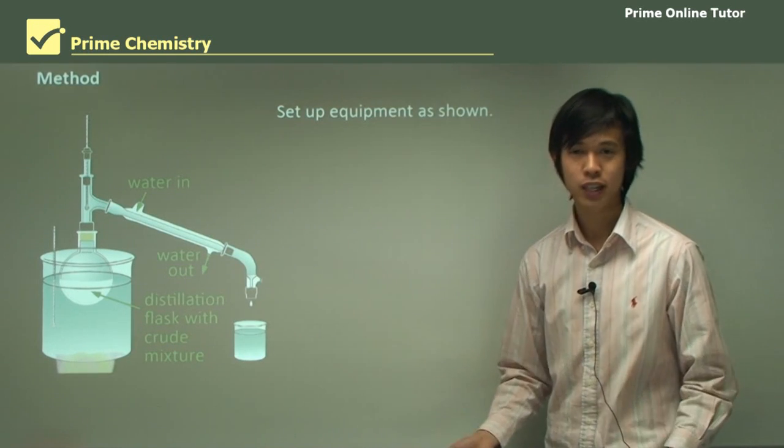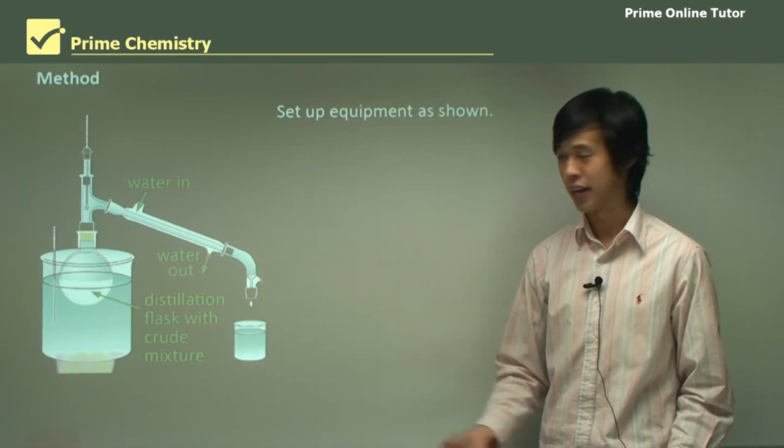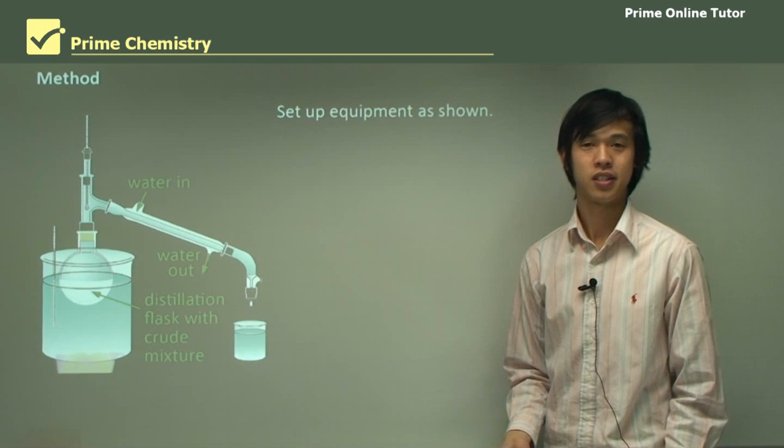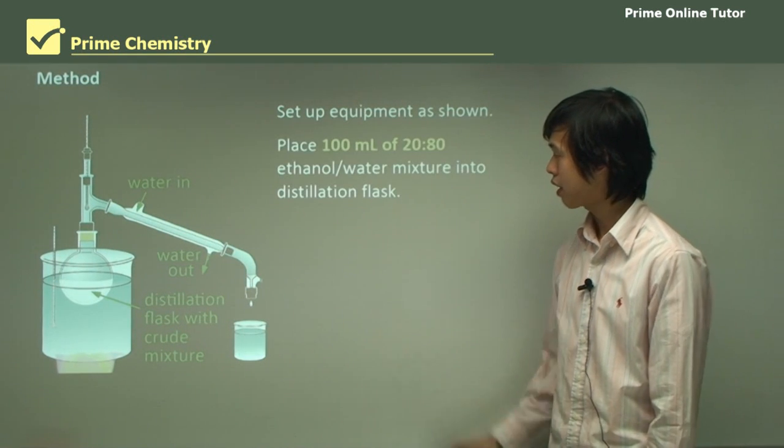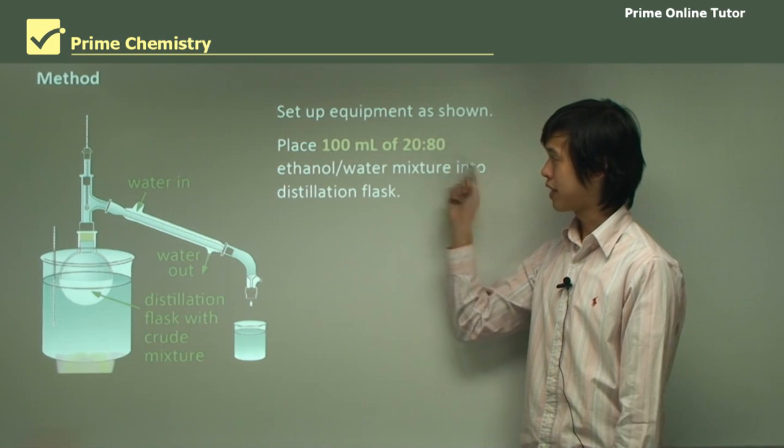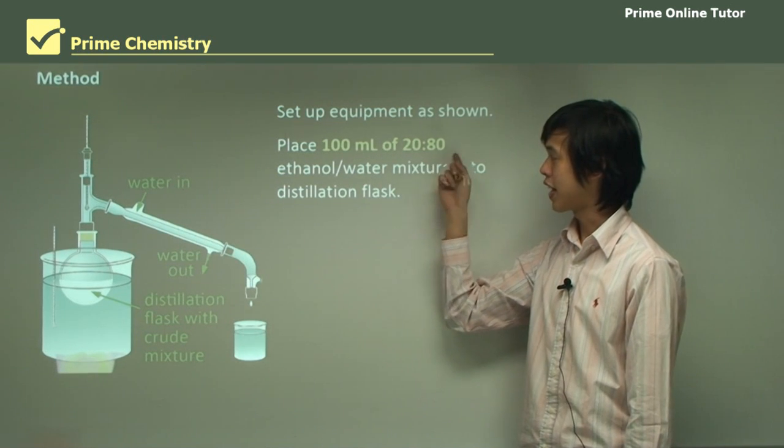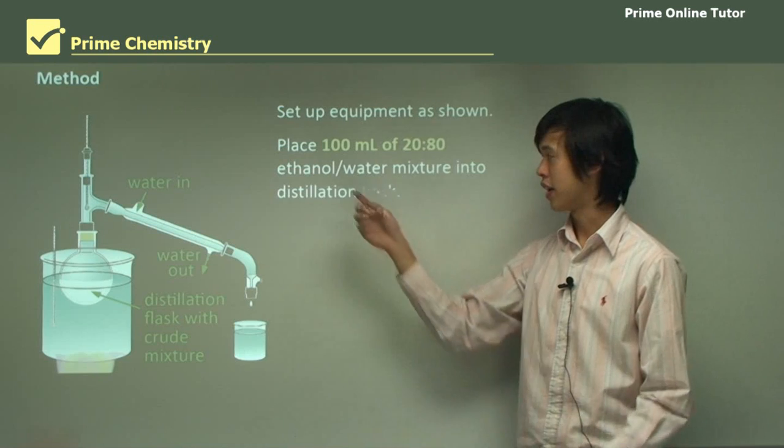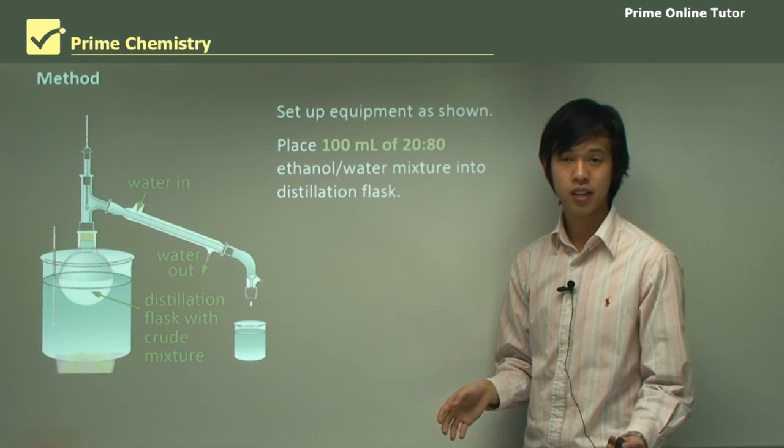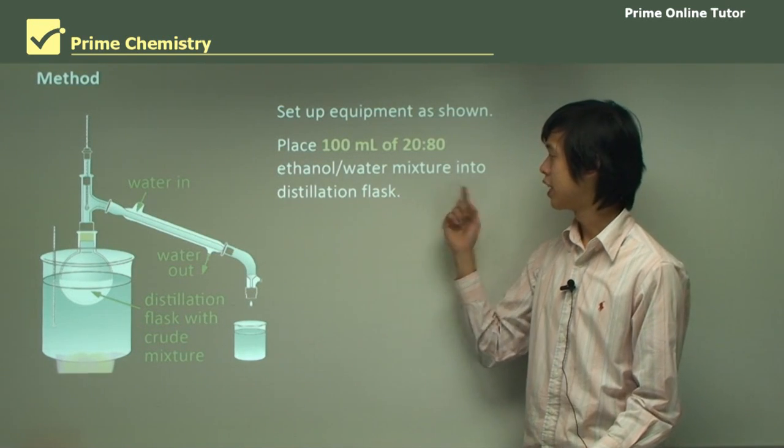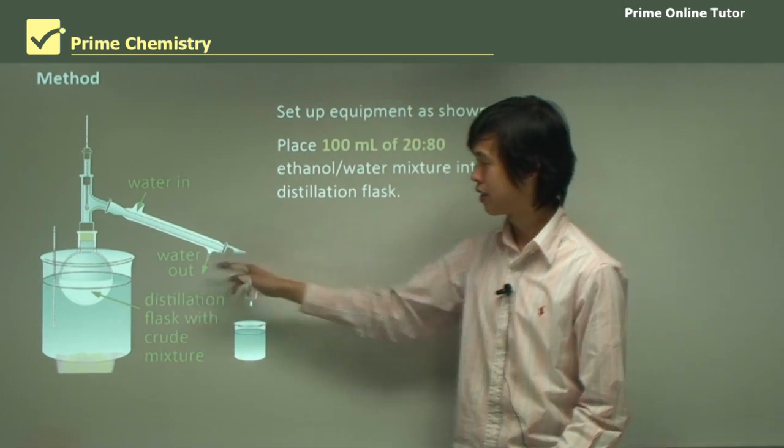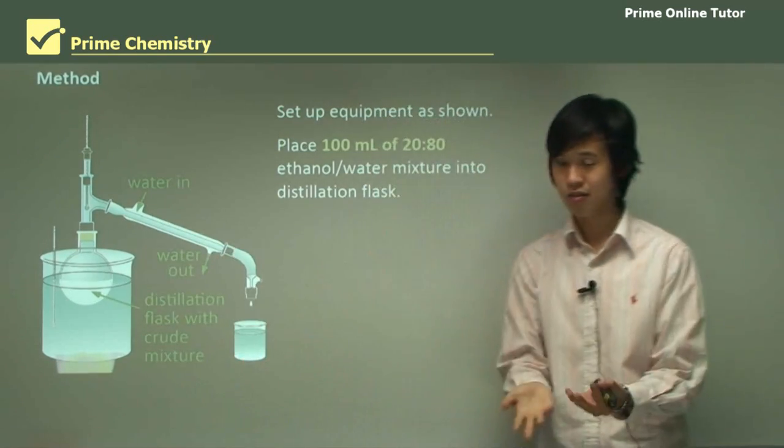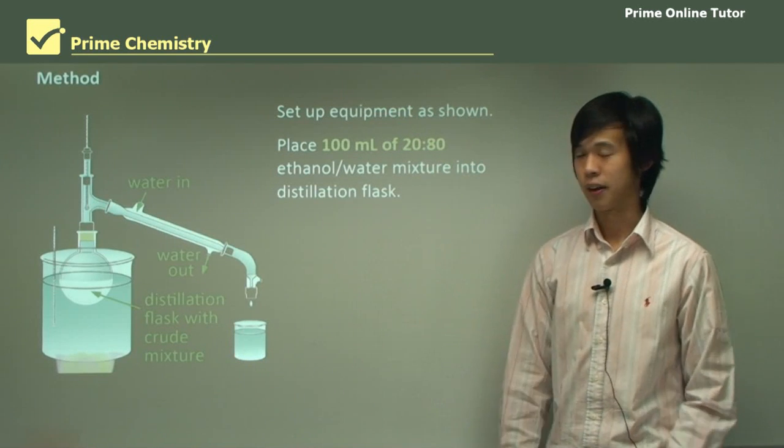And it's not a very fast prac, so you have to be a little bit patient. It will be quite slow at the start. So what we do is we place 100 ml of 20 to 80 ratio ethanol to water, so 20 ml ethanol, 80 ml water, into a distillation flask. So we pour this mixture into here, and we have 100 ml in total.